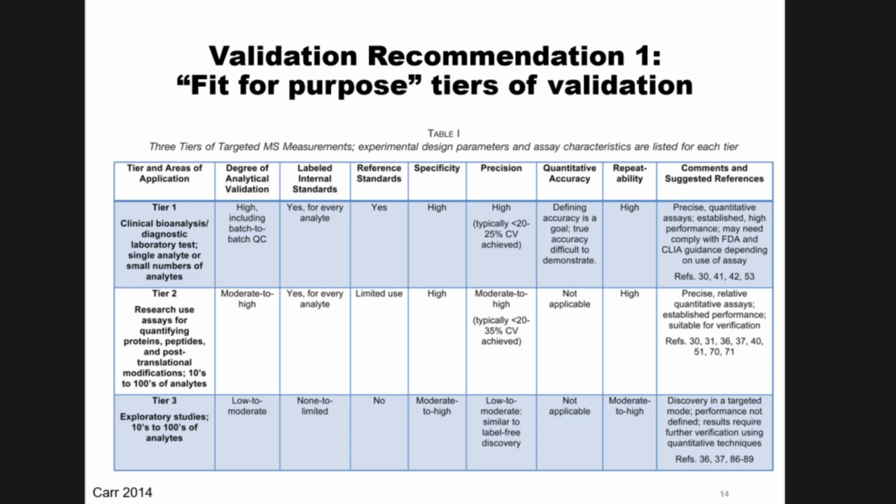You'll notice the same themes. I'm going to show you some of these guidelines. Some of the guidelines from that fit for purpose paper say it depends what you're doing. If you're doing clinical proteomics, your calibration and validation standards are probably going to be a lot more strict than if you're just an academic doing yeast biology. I probably don't have to be quite so strict in my calibration and validation. So it's the fit for purpose idea: depending on what you're using your assay for, you might have different standards for your calibration and validation.